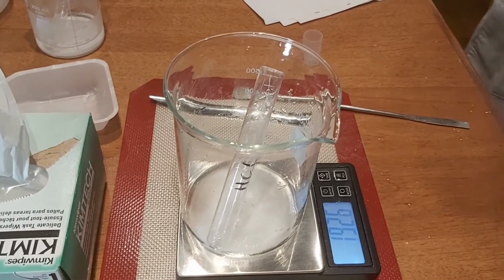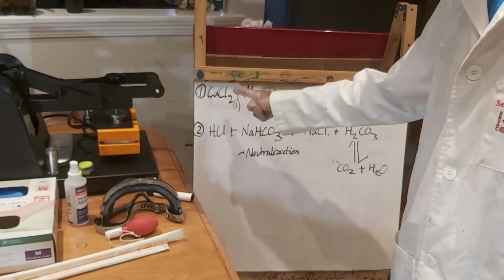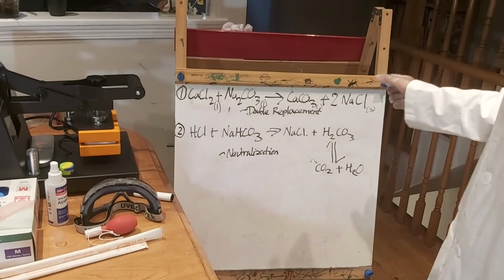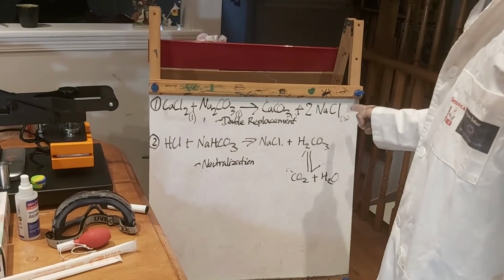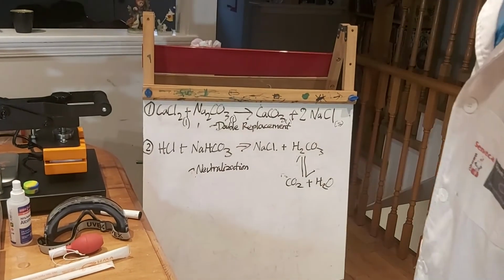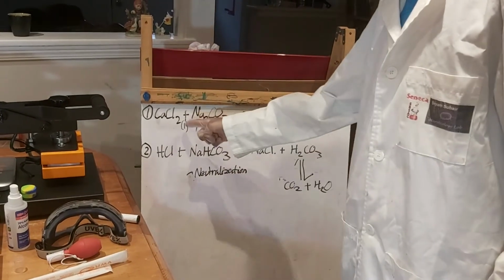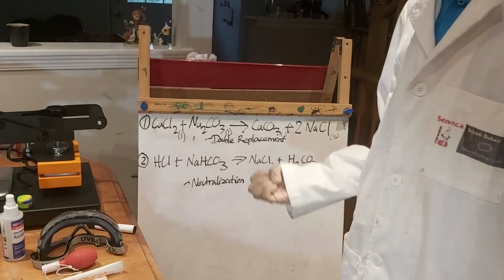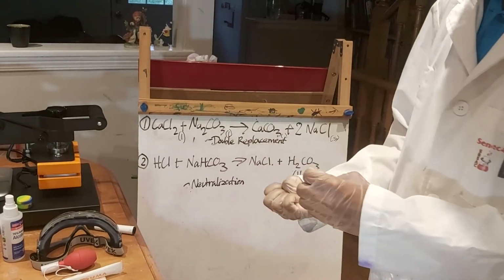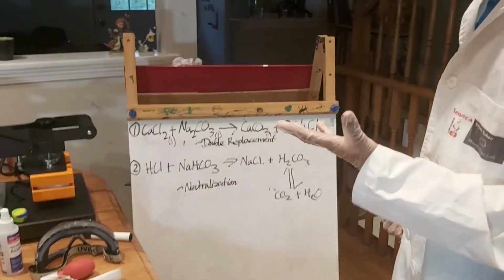And the conclusion for this series of experiments is that in our first experiment series, we had calcium chloride and sodium carbonate in a double replacement equation, yielding calcium carbonate and sodium chloride. In both the open and closed systems, there wasn't a significant difference in mass because both of the reactants were liquids, and now you have a liquid and a precipitate. And even if the system is open, a liquid or a solid won't really escape from it, so there's not a big difference.